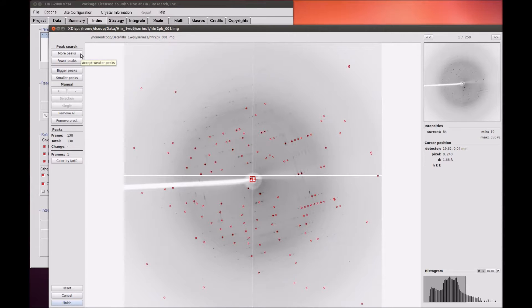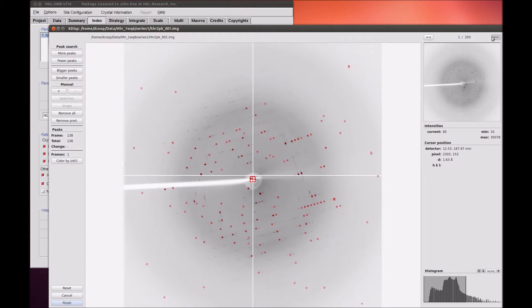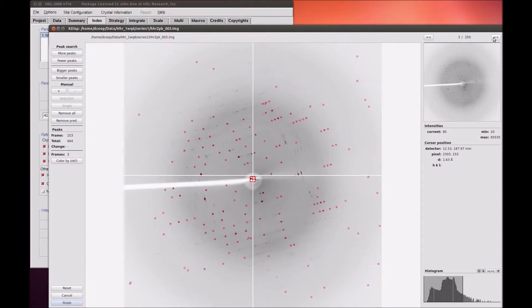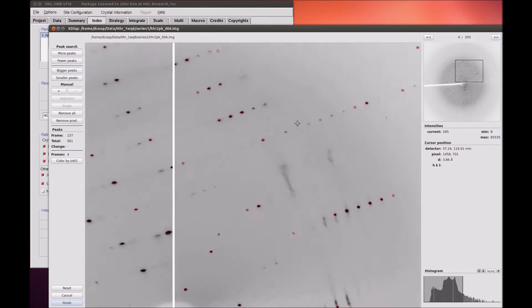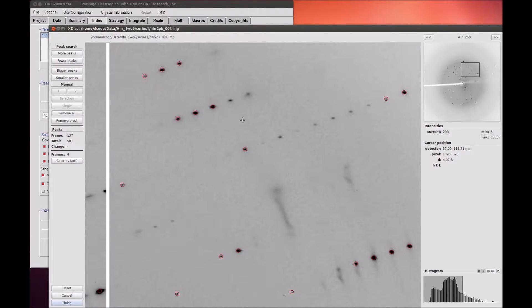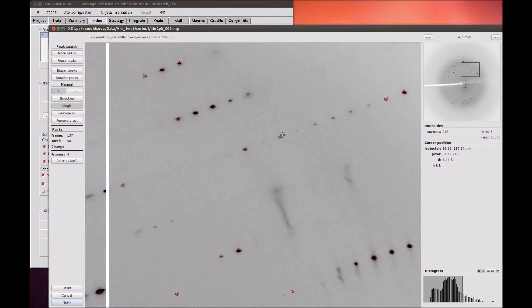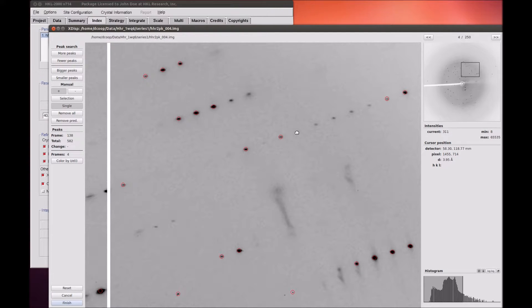Use the Frame Up button to increase the number of frames that will be included in the peak search. If you want to manually change the peaks that are picked, use the Plus and Minus buttons to add or remove peaks. With the Plus button, click on a reflection to add it to the peak list.